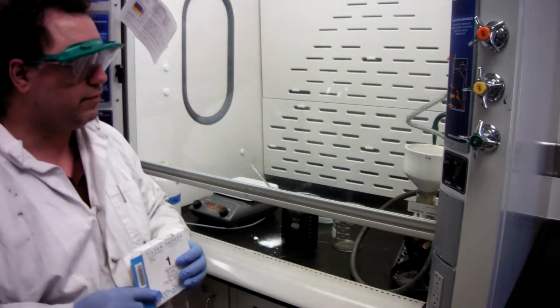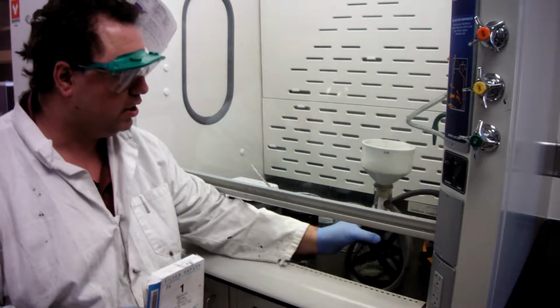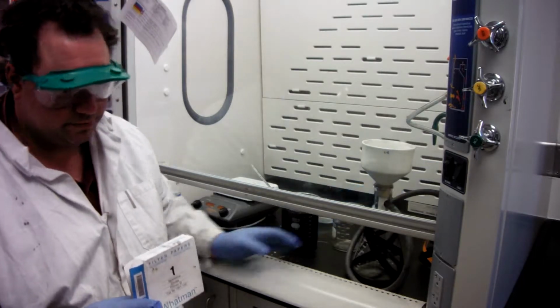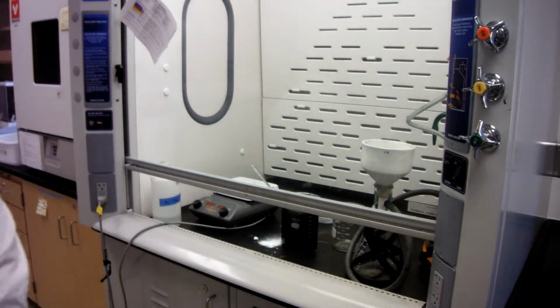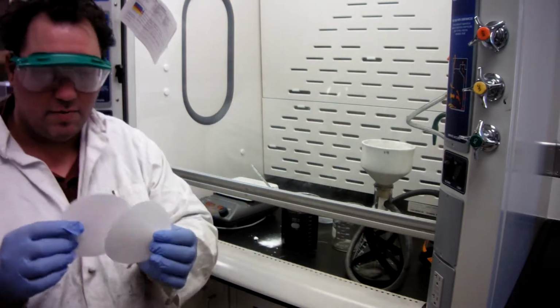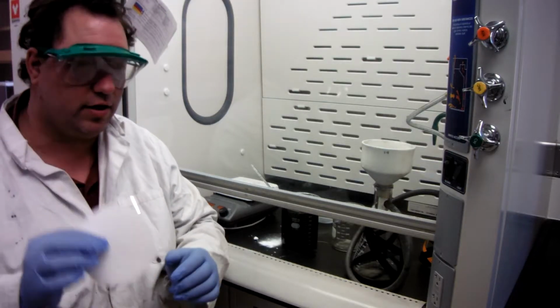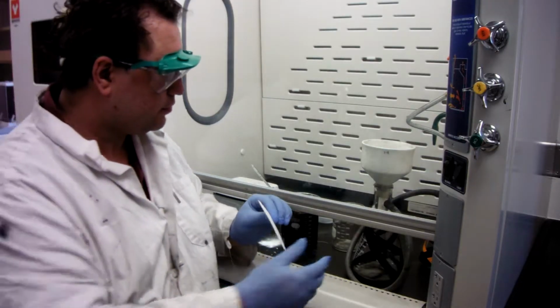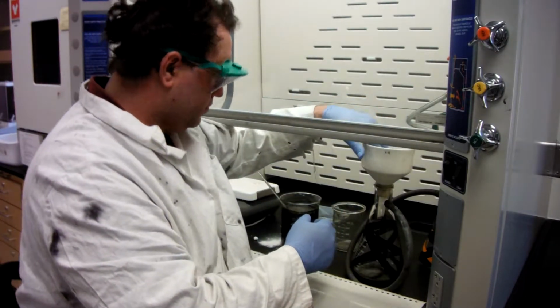So here at Evergreen, in every hood we have a vacuum filter set up. We have a Buchner filter with a large filter plate. First thing to do to the vacuum filter, since we're doing a sludge, is take 2 filters and put them together. This makes it actually filter sludge better than just one filter. We're going to place them both in our receptacle.